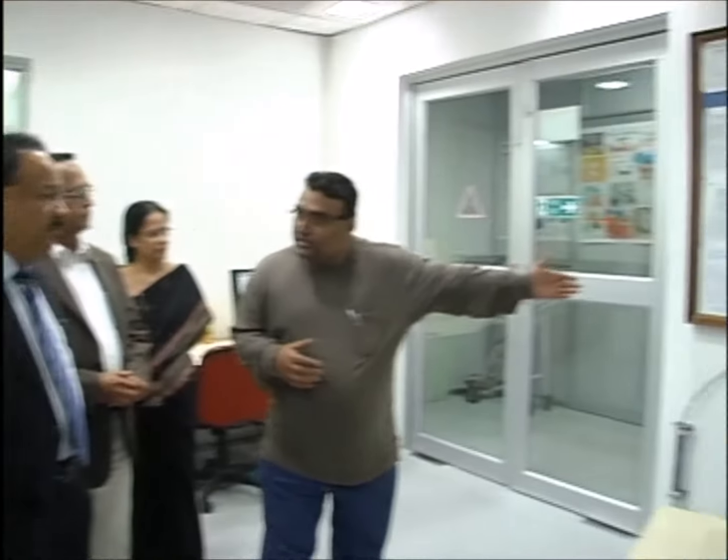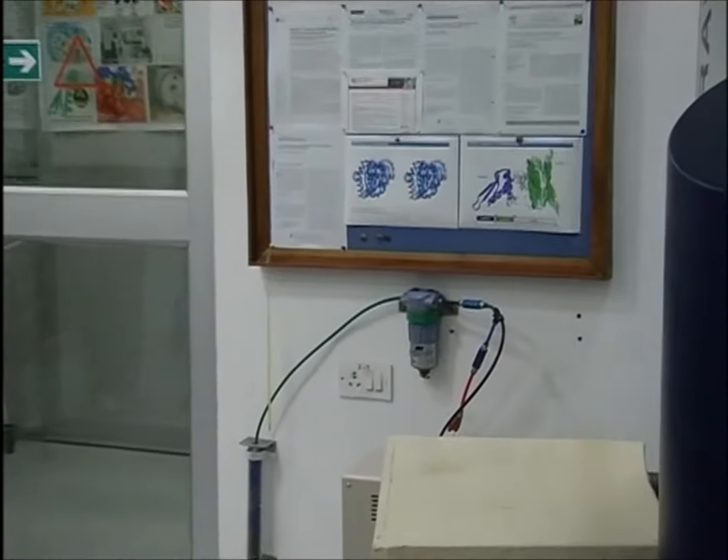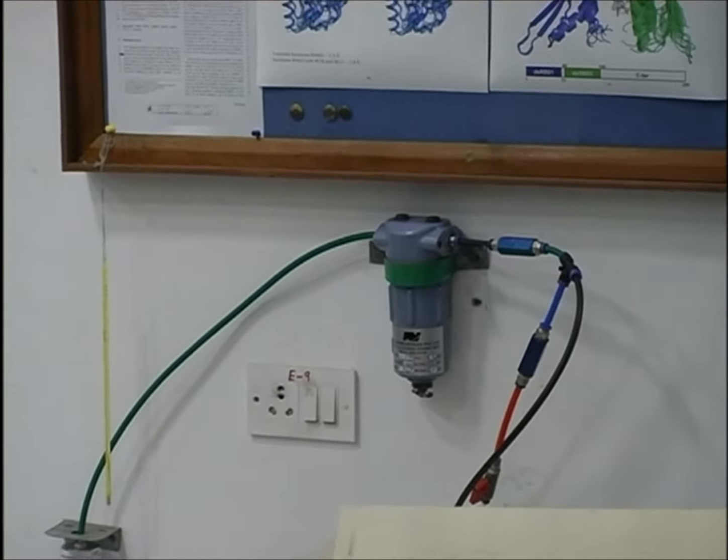are involved. For example, my lab has solved the structures of proteins in solution. So the advantage of this technique is finding the structure of a protein in physiological condition, like how it would be in the cell and how it would function in the cell. Also another advantage of this technique is that we can understand the dynamics of a molecule.